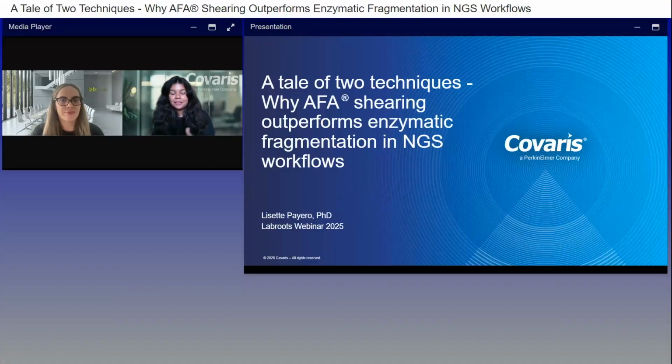Oh, yeah. So that's a great question and a very fundamental question. We do recommend for DNA shearing to use 1xTE, which is a buffer that is very accessible. I'm sure most people working in labs have used it before. And we do recommend not to shear in plain water, as you do need the buffering capabilities of something like TE when you're shearing DNA.